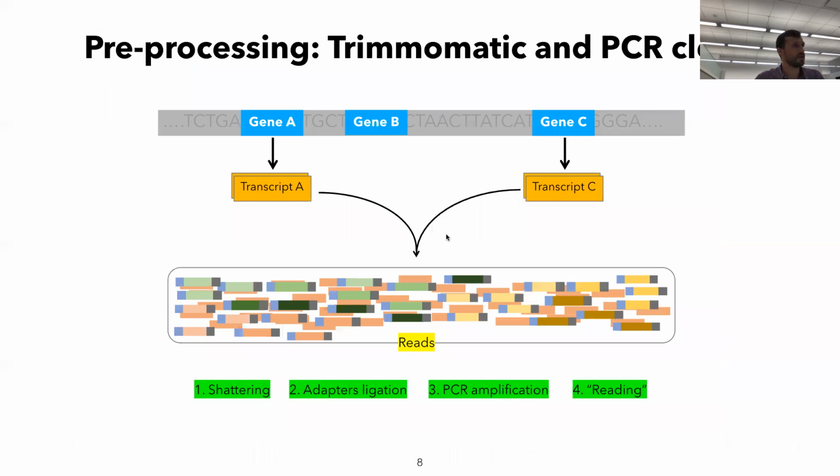So this is just an idea of, okay, what are we looking at in terms of data? Now, in terms of preparing this data, and we went through all of this last time, really just to reiterate, what we're doing is we're trying to identify which genes, which are certain locations on the full genome, are transcribed into transcripts, into mRNA, not on the DNA, but in mRNA format. And we need to understand in the context of the sequencing process how the preparation of the data has an impact on our analysis of the data.